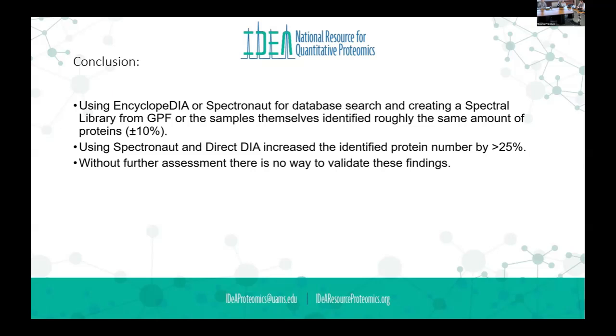Personally, I turn off the imputation. I don't want it in my data, because then I'm dealing with that on the back end when I do my analysis. Then I can do whatever I want with the numbers.